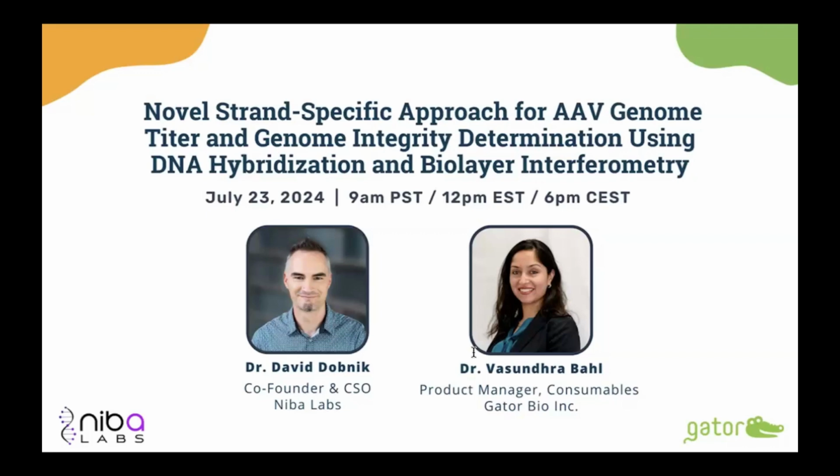Thank you, David. And another question here. What is the time to results using Gator's product for capsid titer? The product for capsid titer relies on direct binding, and you can analyze 8 samples in parallel in 2 minutes. And for very high titers, it's as quick as 30 seconds. Depending on the instrument, it can be 8 or 16 or 32 samples in parallel. So if it's a very high titer, ranging 1E12-ish, then it's about 30 seconds. If it's lower titers, then 2 minutes.